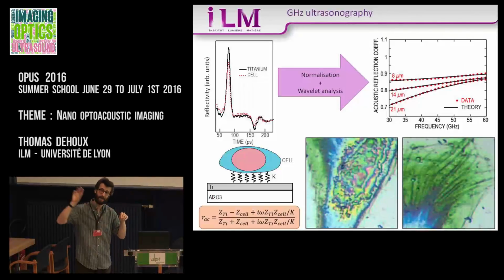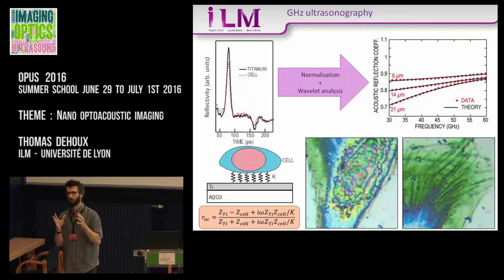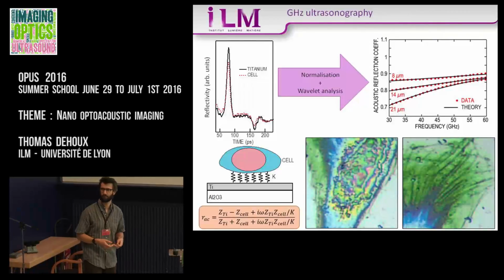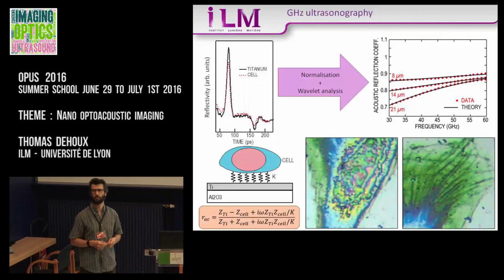If you want to sense the elastic regime, you need to go to higher frequencies. You need to apply a strain rather rapidly, which is difficult, although maybe possible if you modulate the trap fast enough. I think that's the main advantage of this. But the disadvantage is that you have some contact, so there are pros and cons perhaps, but I agree that the temporal regimes are different.